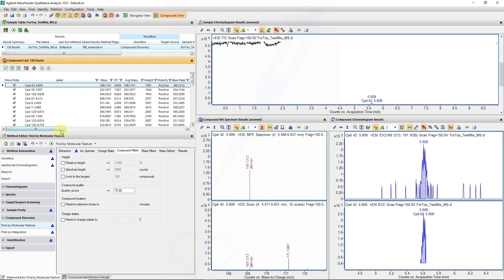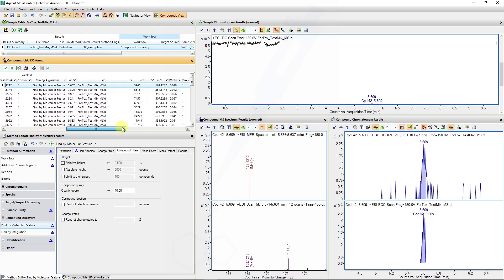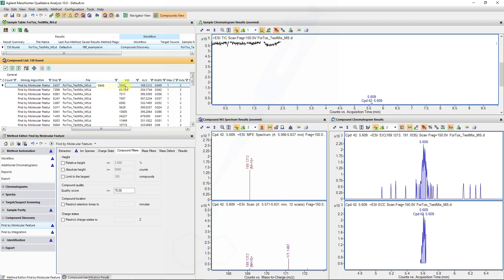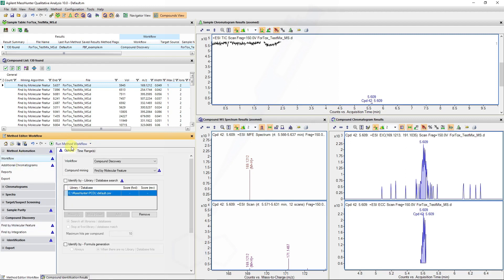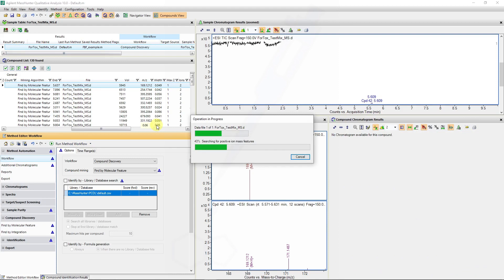Notice with the molecular feature extraction algorithm that we now get a value called the volume instead of the area. That represents the sum of the total volume of all the different charge states, as well as a weighted value encompassing the retention time. Let's apply an extraction peak height threshold of 1000 and rerun that workflow to see if that reduces our 130 compounds down.